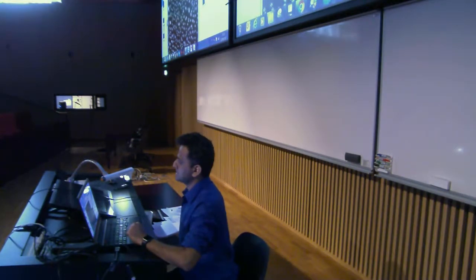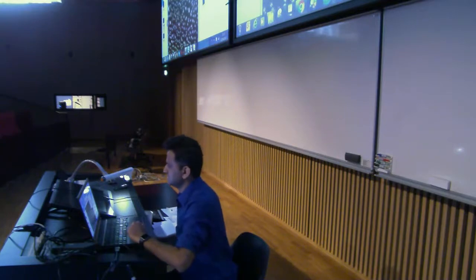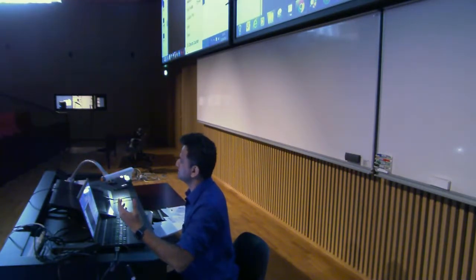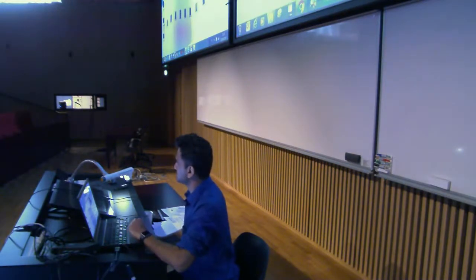So if you are only interested in knowing how many nuclei are there in such a low contrast image, then one should go for find maxima. If you're only interested to know how many nuclei are there, or how many cells are there in this case, so one can go for this. See, this is a point, and then you can actually go to analyze and do the same thing, analyze particles, to know how many nuclei are there. I think this would work best for the foci detection.